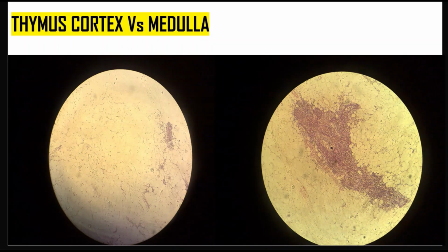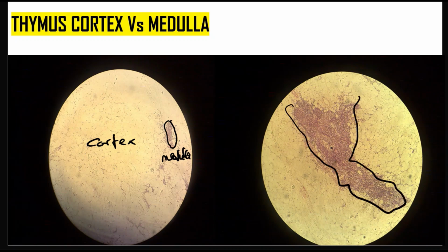So let's zoom in. You've seen, the medulla is dying off. Okay. So this is the cortex. This is the medulla. By a certain age, the thymus will totally involute. This is showing the same thing. This is the only functional part. The entire rest of it has been involuted or is dying off. Okay. So now, that was the last histological diagram that we were doing.